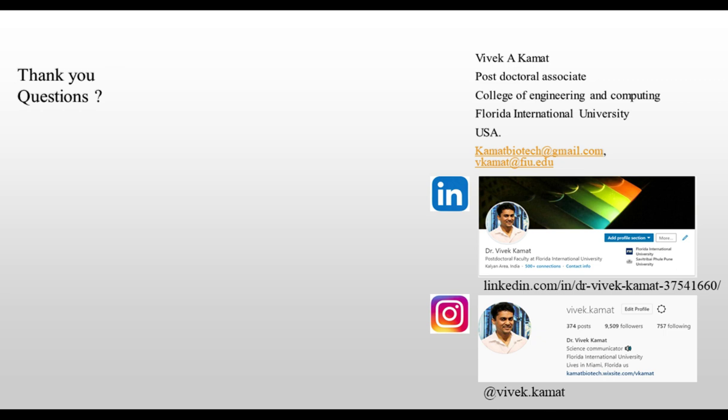Can you repeat the question? Absolutely. Valerie is asking, why not use serum-free medium culture conditions? Okay. When we started doing the studies, I never tested with serum-free media because when culturing cells in these kinds of microfluidic devices, I usually end up with less cell viability if I start using media free of serum.